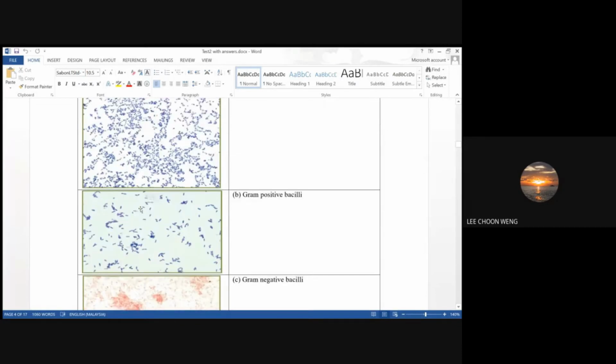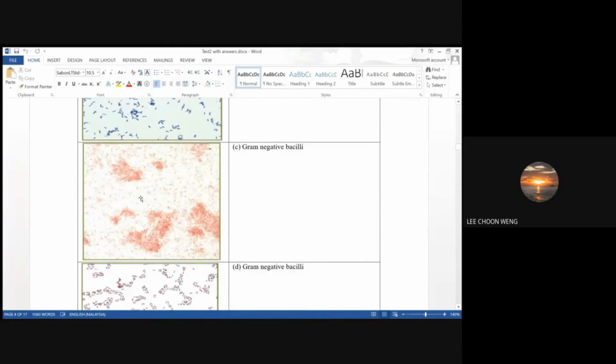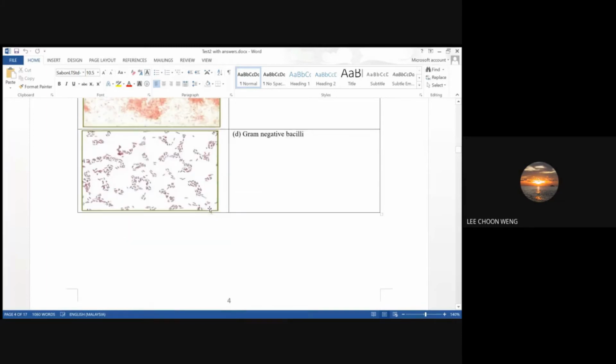Okay, a bluish tinge there. Here, clear gram-negative bacilli. Okay, it's very small, so even if you put coccobacilli, I will not mark you wrong. So this is gram-negative bacilli because although it's darker, it's not bluish. Okay, it's not purplish.